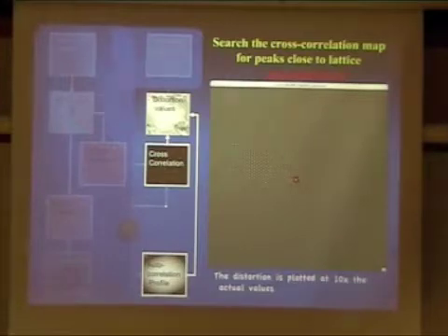So why not just use a circular autocorrelation profile? Why does the actual shape help? Sometimes you will have a peak that's pretty far from a circle. I'll show you something. If you have a little rotation, by definition your correlation should go down. And if you don't do anything and then threshold, you throw those away. I think this is the basic trick one uses. The refinement would be that you would try to get the unbending taking care of the rotation.